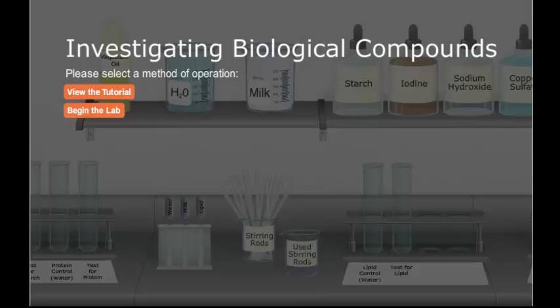We use what's called the paper bag test in our lab. You take a brown paper bag, you lay your test item on the bag. It will leave a wet spot. You pick it up, and if the wet spot disappears in about 15 minutes, that was most likely due to water. And if it is still present, it is because it is from a lipid, which, if you've ever seen an oil stain on concrete, will not dry out and evaporate.